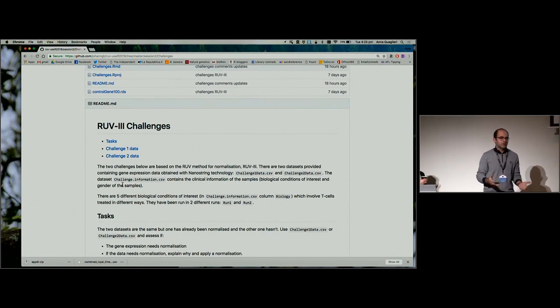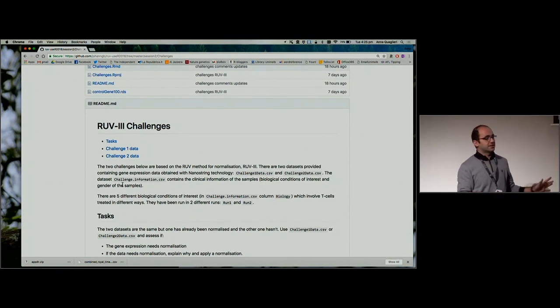I should say no. You should try different Ks. I have been working in this area for 3 years. Without positive control, it is impossible to say that you got your data well normalized. There are plenty of papers that say they got the data normalized, but they don't show any hint of how the normalization works. It's so important. At least you should have some positive controls. They can be genes, or statistical plots like the PCA, and some genes that we know in biology as positive controls.